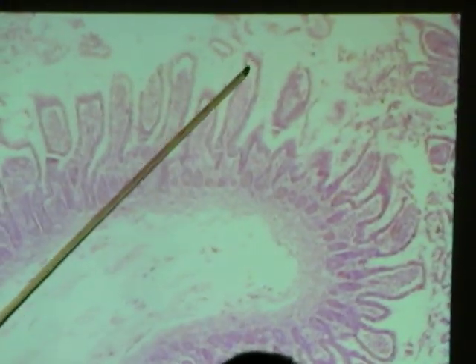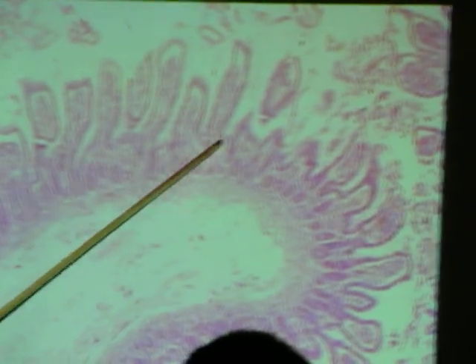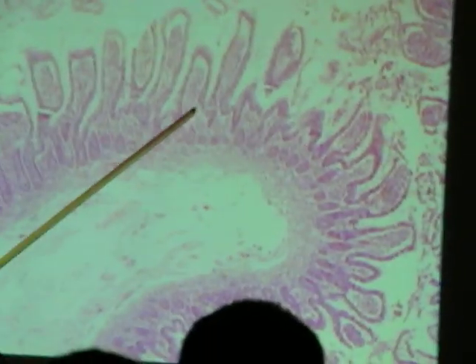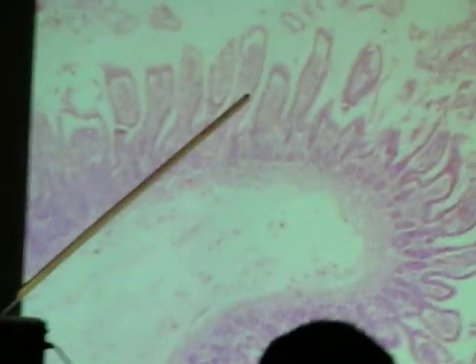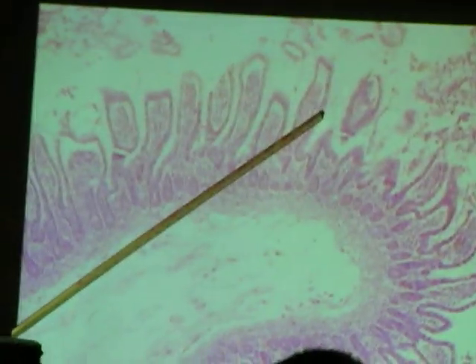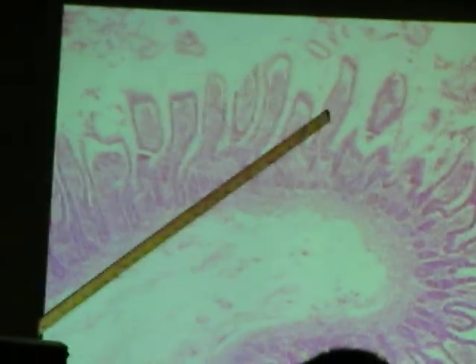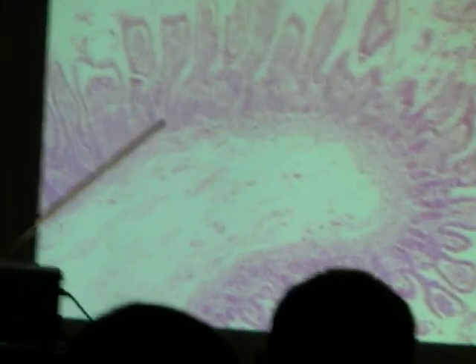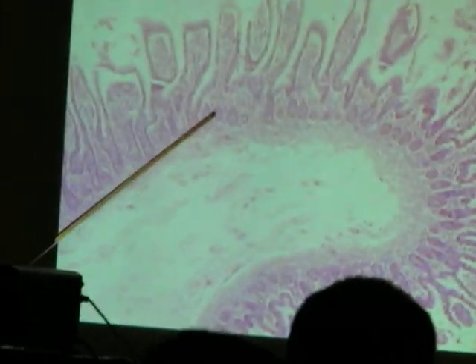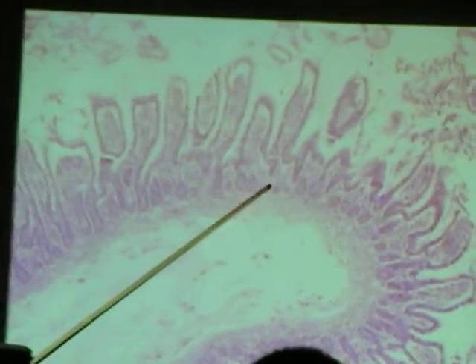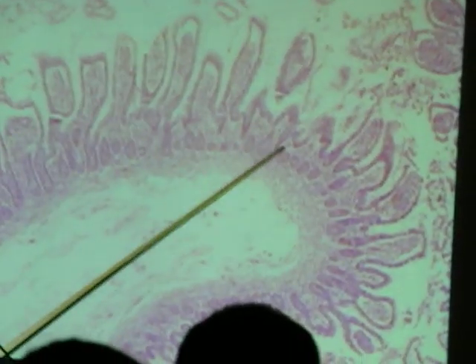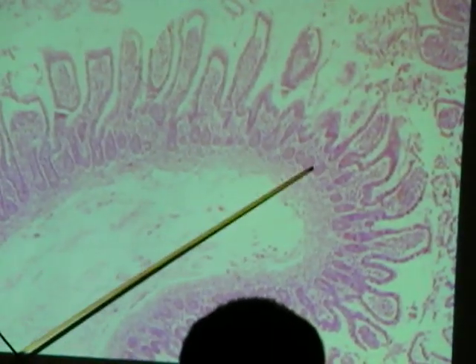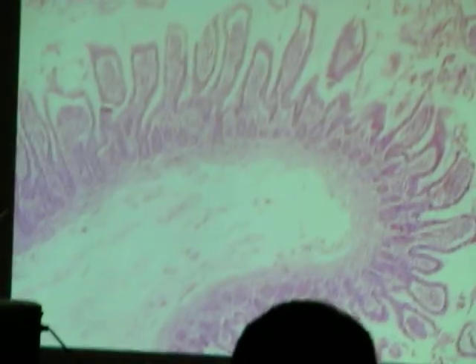Everything that's within the villi and then comes down in here, what would that be? The lamina propria, because remember the cell layer is right here, and below that would be the lamina propria. And then all of these circles in here are going to be the intestinal glands. So all of these circles down here.